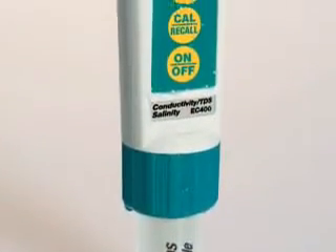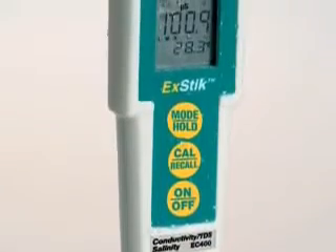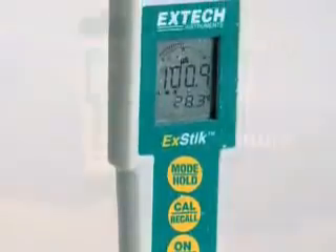These advanced auto-ranging sensors offer you convenience in measuring more than one parameter without having to carry multiple meters or electrodes.